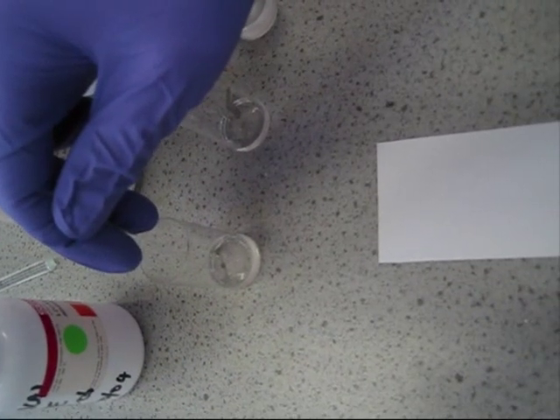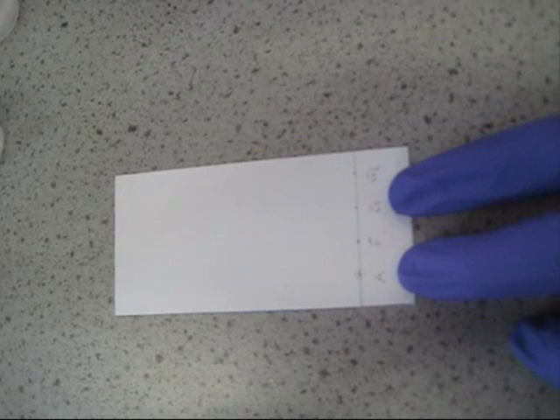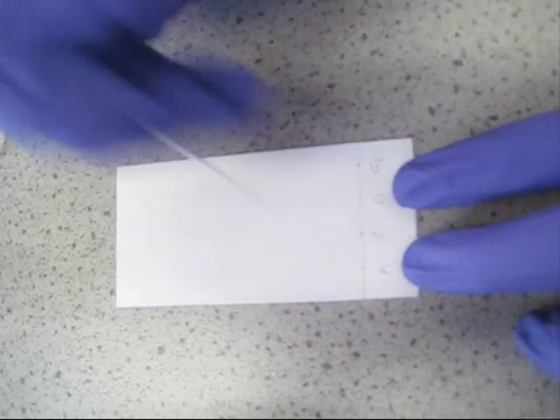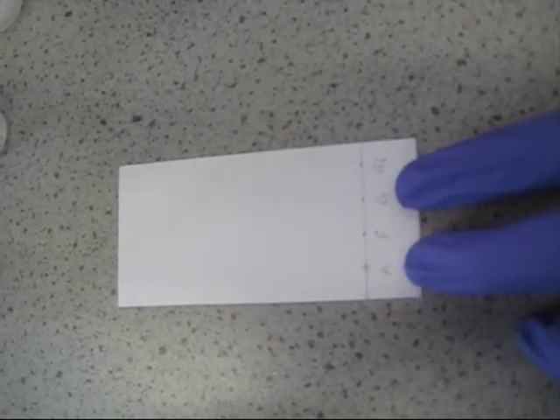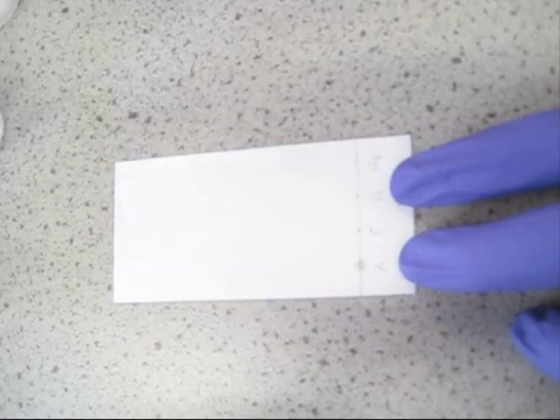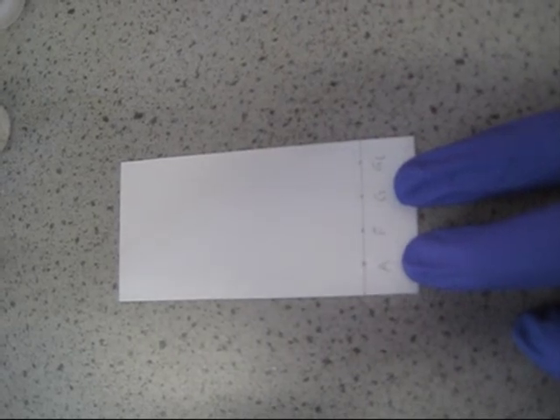To spot on our solutions, draw a little bit of solution up into a capillary tube, and then place a small spot on your TLC plate. Wait for the spot to dry, then add another spot. Wait for that to dry, then add one final spot. Repeat the process for your remaining samples.